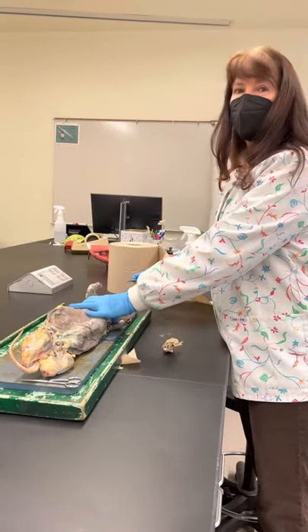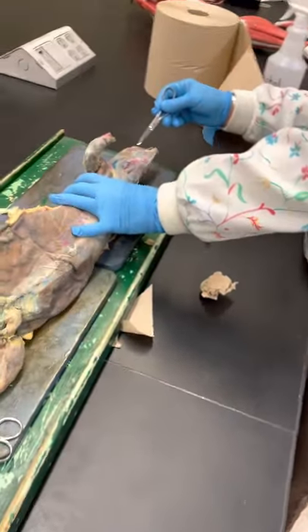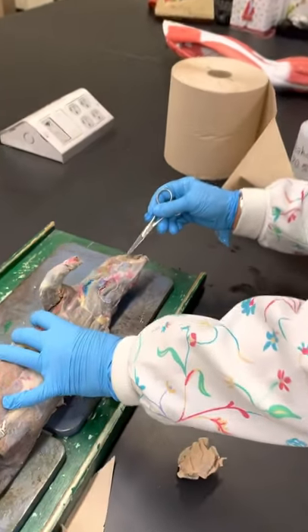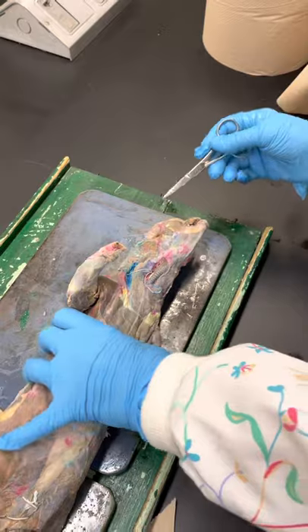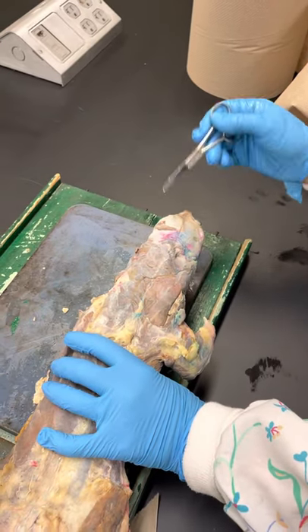You might want to get a little closer so you can see. Here's the masseter in the cheek area, and here's the temporalis on the top of the head. Those two are pretty easy.